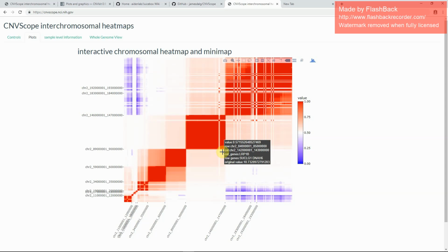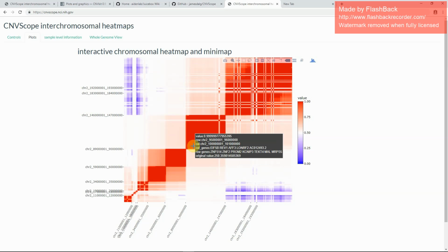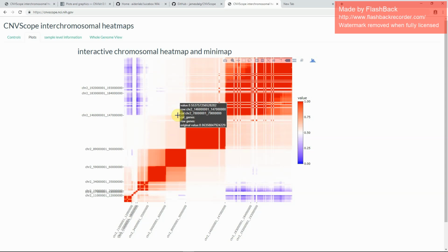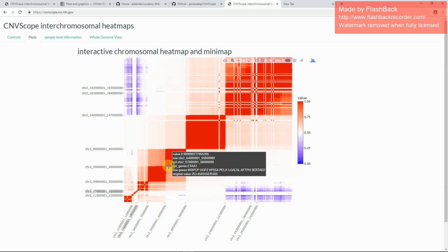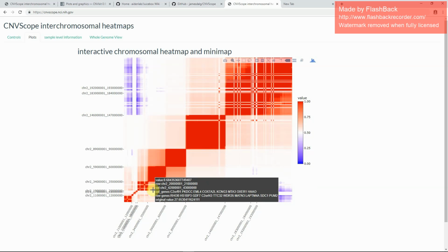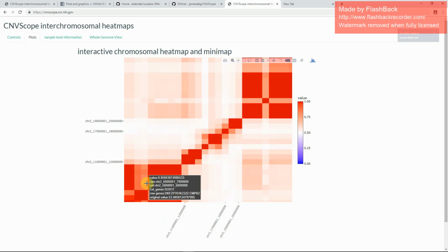So what's obvious is there's a number of things. One, we have domains along the diagonal, more than 2, as we talked about earlier. Additionally, we find this cross, this place where there is no red domain, where there is a strong linear correlation between the copy numbers. And if you zoom in right in there, you'll find what you're looking for.